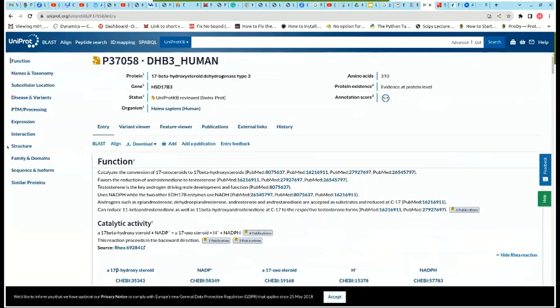So we can also do that, as that will give us a template for our work. But there's an opportunity in Swiss model to build or to predict protein tertiary structure without a template. So we could try the two. So just click on blast. You've done that before, that should be easier.